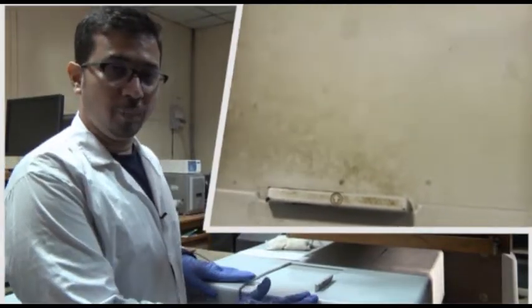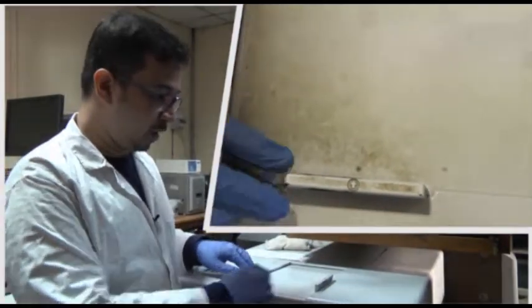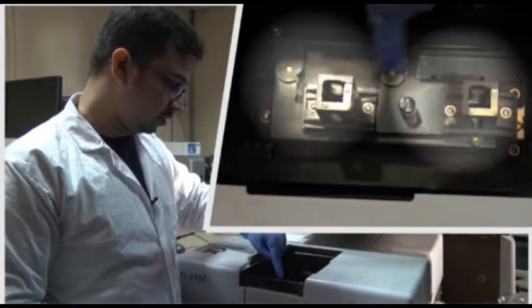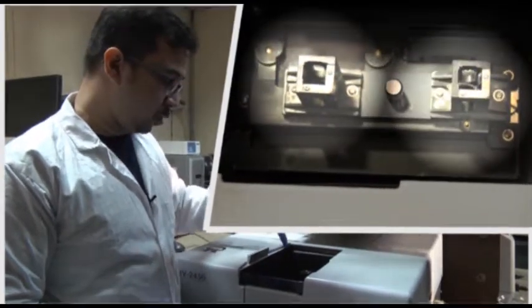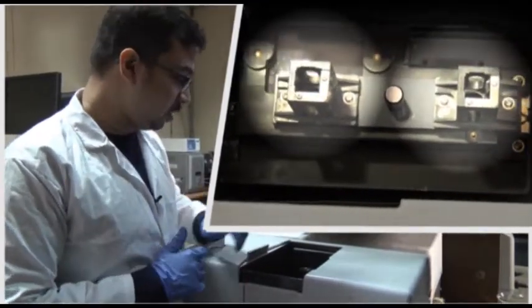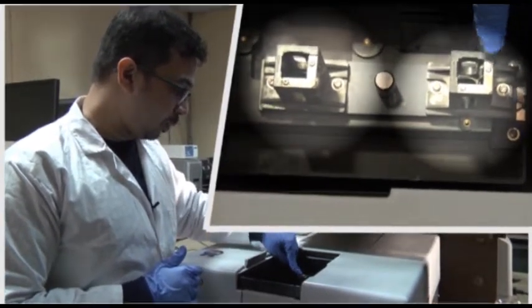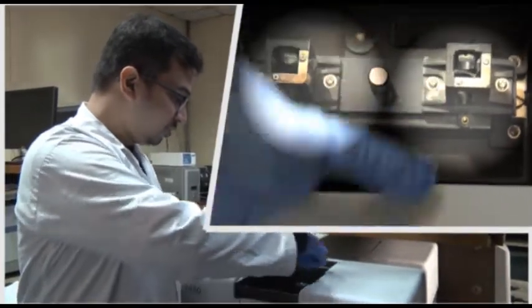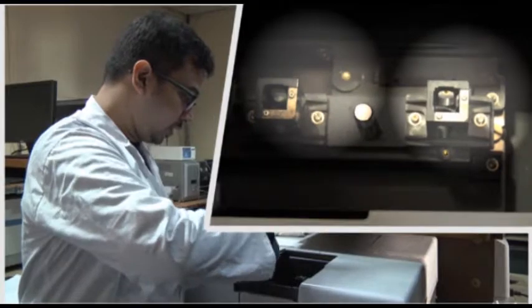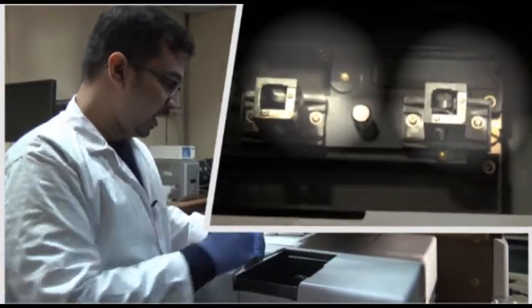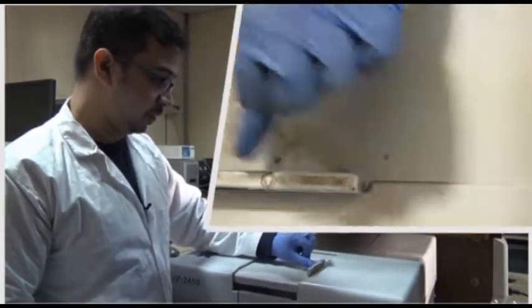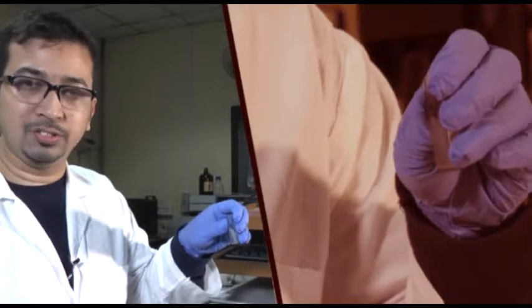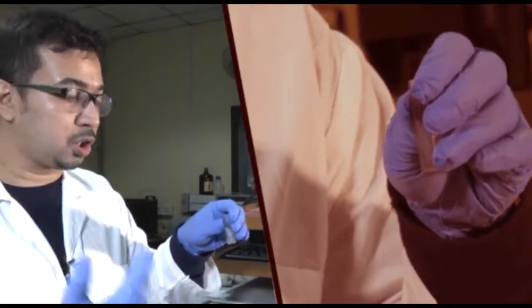This is the UV chamber. Here is the lid of the UV chamber. We can open this lid and inside we can see two compartments where we can place the UV cuvette. This is compartment number 1, this is compartment number 2. The UV light passes through these compartments in this direction. Here we will put our cuvette, and after placing the cuvette we will close this lid.